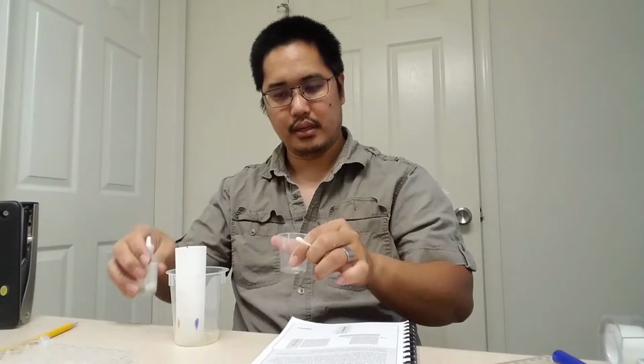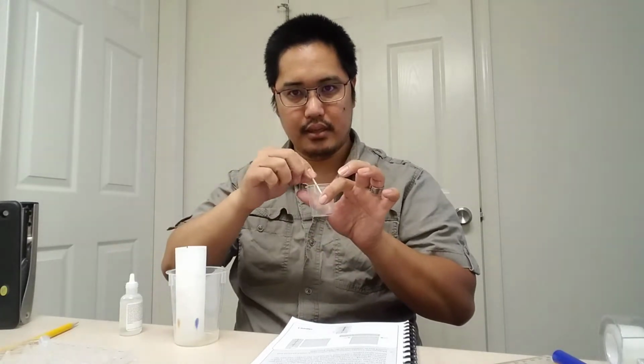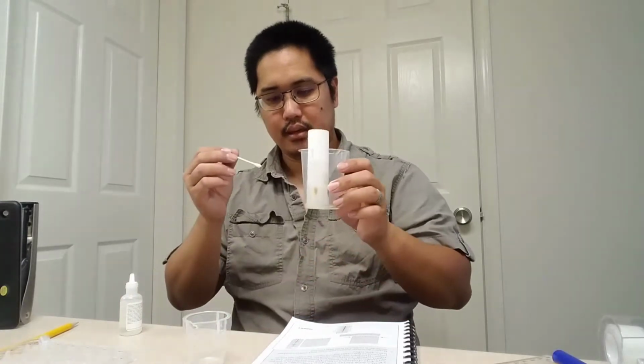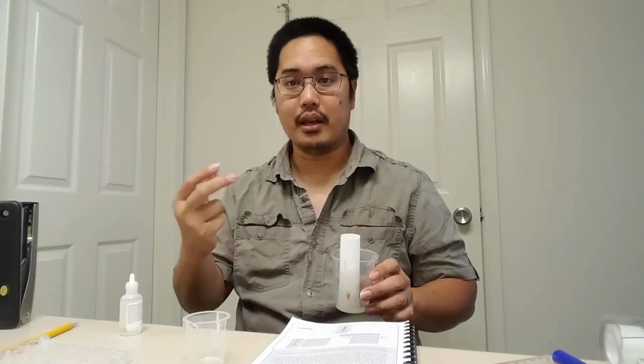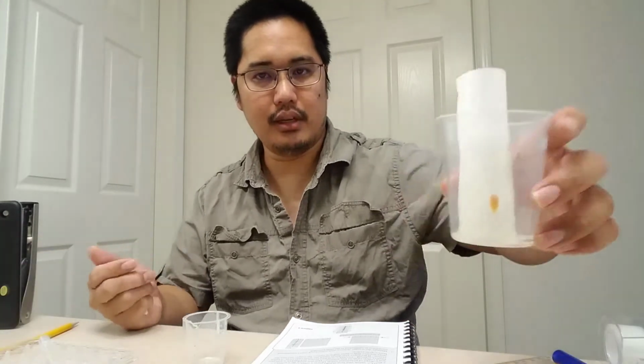After this thing is done, we're going to need to use the potassium iodide to develop the first dot that we had, the copper nitrate and the lead nitrate. And I think what you do is you put a few drops of potassium iodide in a small beaker and lightly wet the cotton swab with this solution. Okay, so we're going to put a few drops of this in here and lightly wet this with the potassium iodide, and then we'll use that to swab the first dot that we did, and that will make it so that we'll be able to see it, and it will develop or appear. So that's how you do the lab.